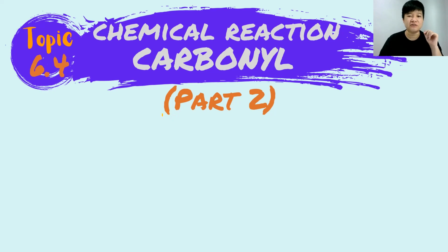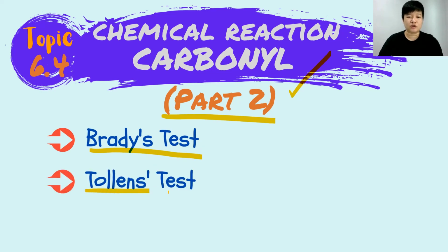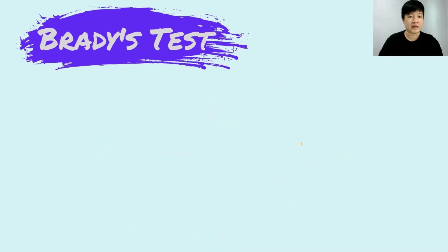And for today's video, it will be part 2 of the chemical reaction of carbonyl compounds. In this video, we'll cover 3 things. The first one is your Brady test. The second, we'll discuss the Tollens test. Last but not least, we'll go into your iodoform test. All of this will be the chemical tests for carbonyl compounds. So let's jump straight into the first one, which is your Brady test.